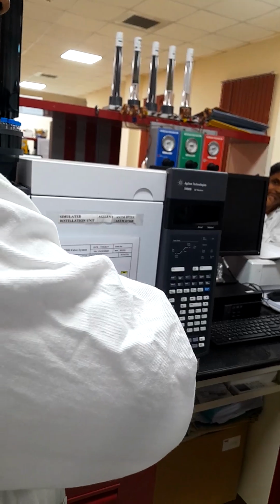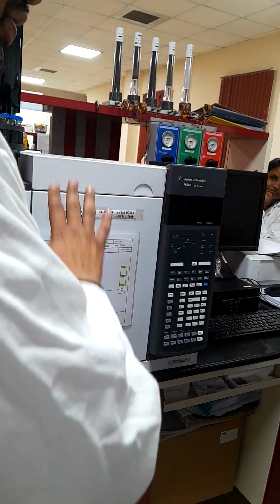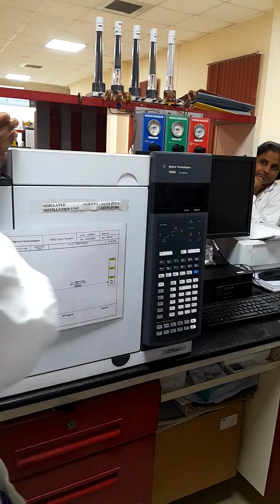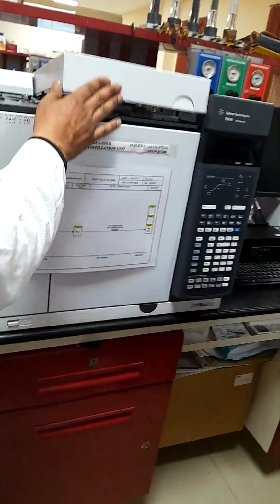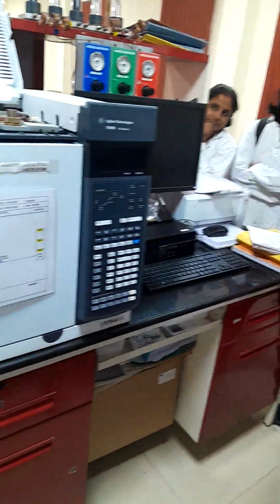Before getting to your query, I will just brief this GC also with the points you have mentioned. There is an auto sampler. It is connected with this inlet point. This is the inlet point. Give me the paper. I will just demonstrate and come to your point.